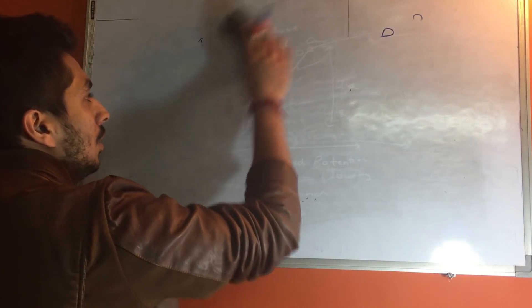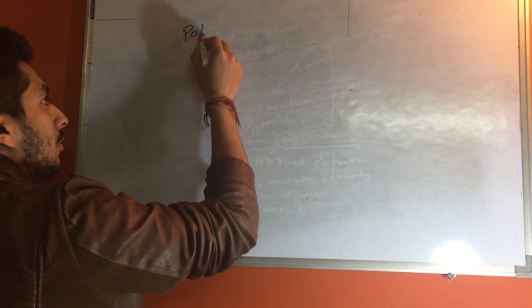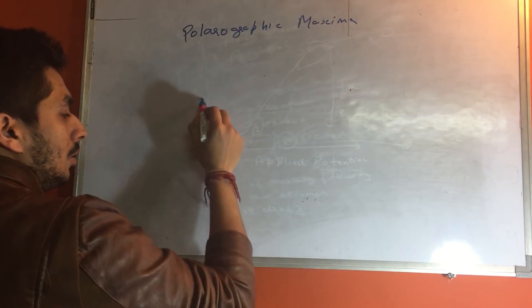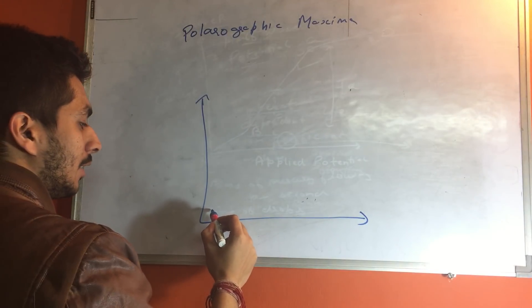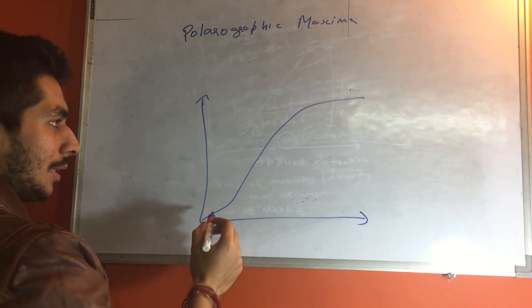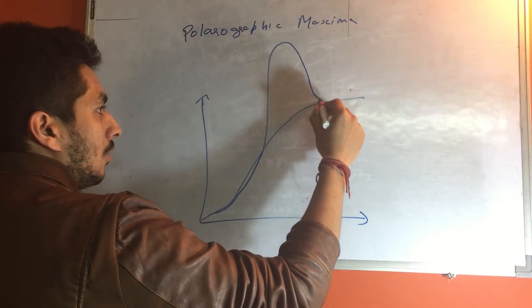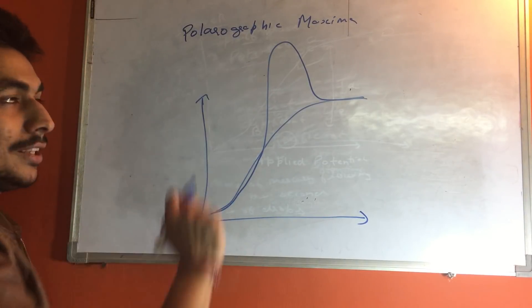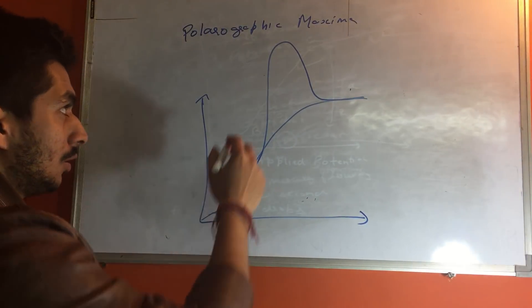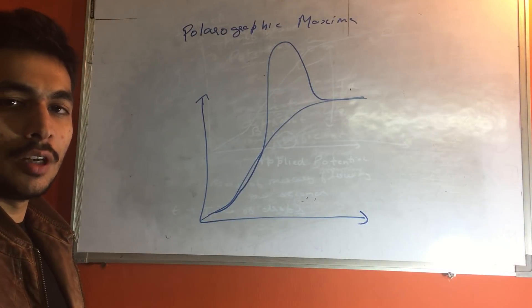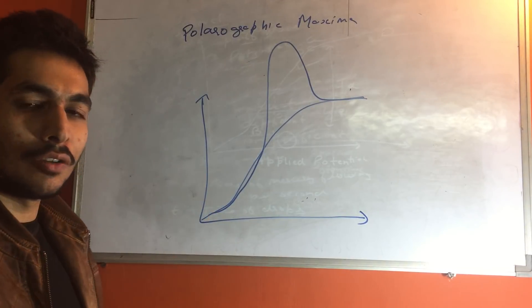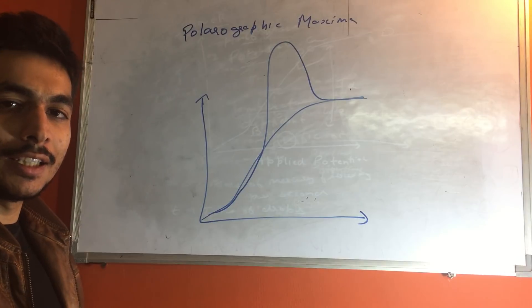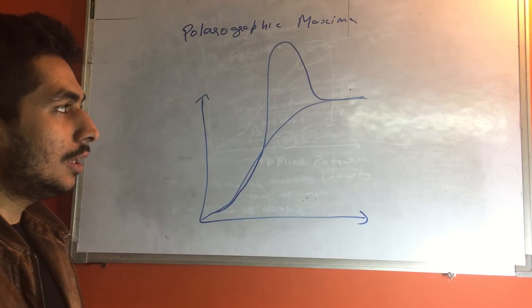Now, there is a concept called polarographic maxima. Generally the polarogram looks like an S-shaped curve, but sometimes instead of this S-shaped curve you see a peak. This is called polarographic maxima — it is a problem that arises in polarography. One might think this peak is because of the presence of a second kind of analyte in the solution, but it is not. It can be misinterpreted as a second analyte, but that is actually a problem with the polarographic maxima.